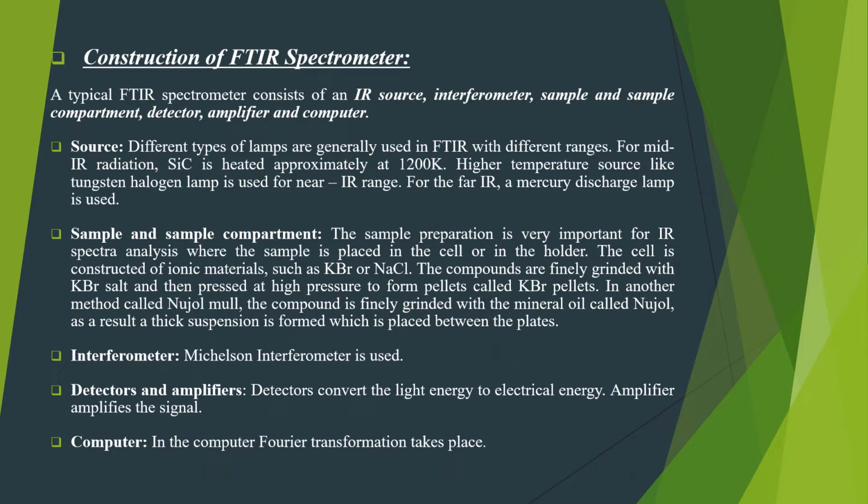In another method called Nujol mull, the compound is finely ground with the mineral oil called Nujol. As a result, a thick suspension is formed which is placed between the plates. Interferometer, Michelson interferometer is usually used. Detectors and amplifiers. Detectors convert the light energy to electrical energy. Amplifies the signal. Computer. In the computer, fast Fourier transformation takes place.